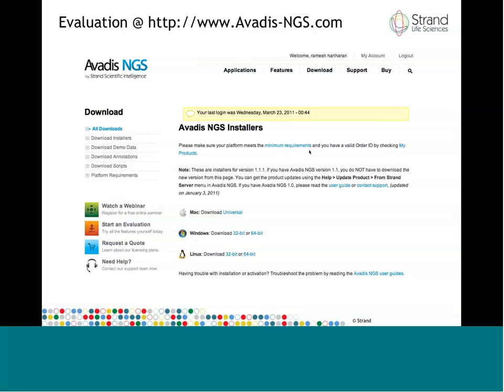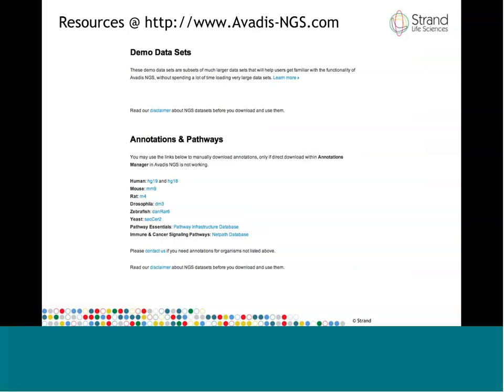Once you download and install a trial version, if you want to learn, some demo datasets are available on the Avadis NGS website. In addition, there's a number of resources that we make available. The annotations for very many organisms and associated builds I've already talked about. And to reiterate, if the organism of your interest is not present on the website, then please feel free to get in touch with us, and we'll help create that package for you.